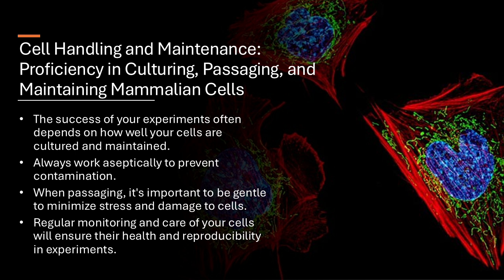Yeah. Is that different for the two types of cells? Definitely. With adherent cells, we first have to detach them from the surface they're clinging to, then dilute them and move them. Suspension cells are much easier. Just transfer a portion of the cell-filled medium and dilute it in a new flask. Got it. So it's like carefully picking up those adherent cells from their little homes while the suspension cells are already packed and ready to go. Yeah. But whether they're home bodies or adventurers, I imagine gentle handling is key throughout this whole process, right? You bet. We don't want to stress them out or damage these delicate cells during the move.